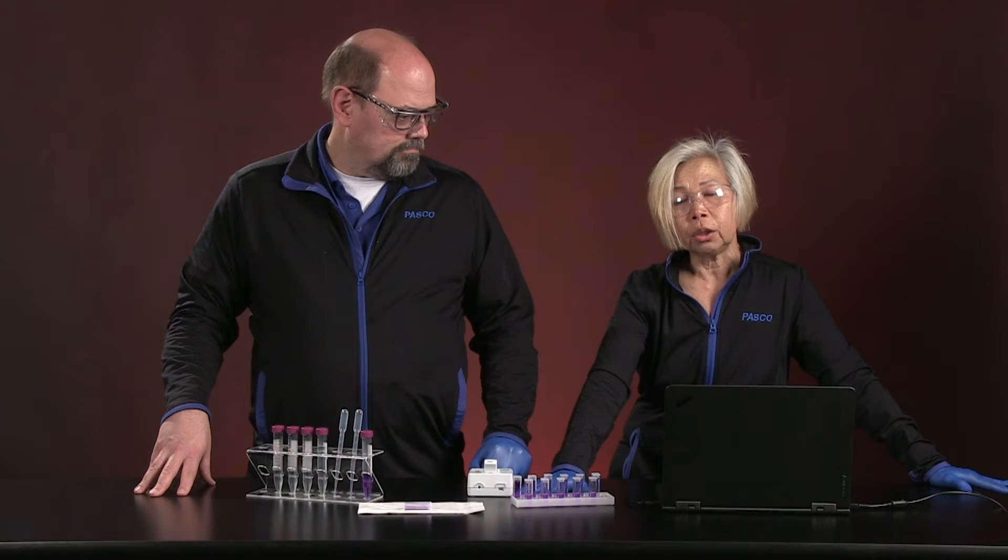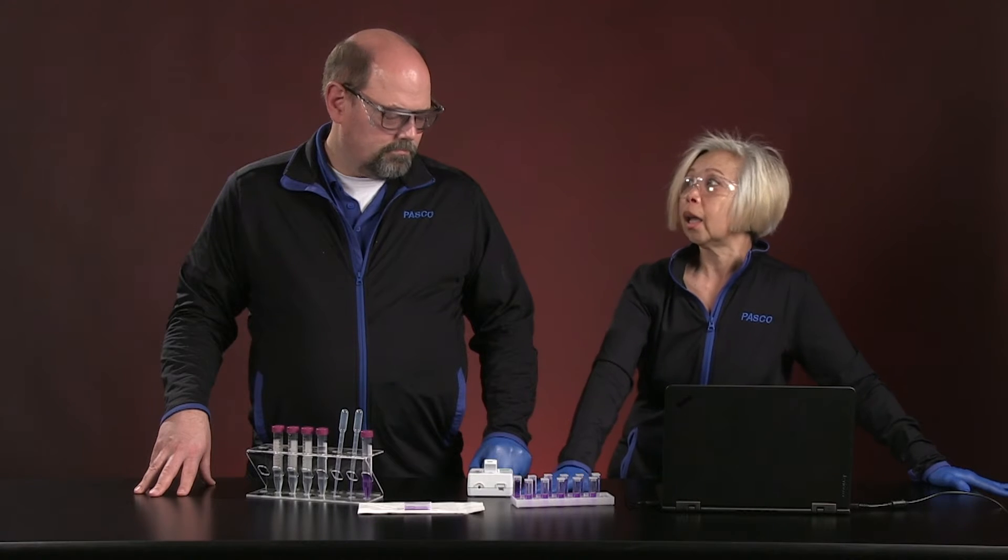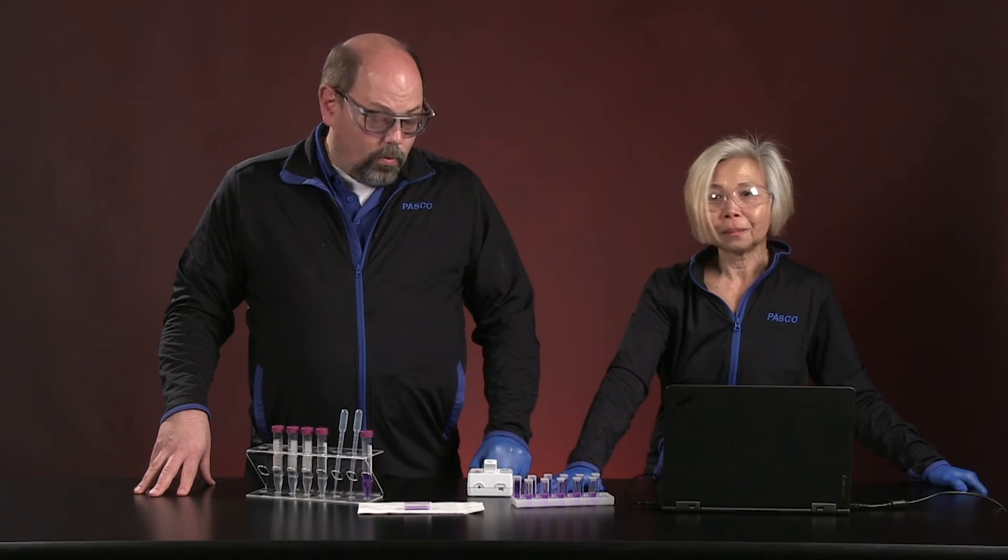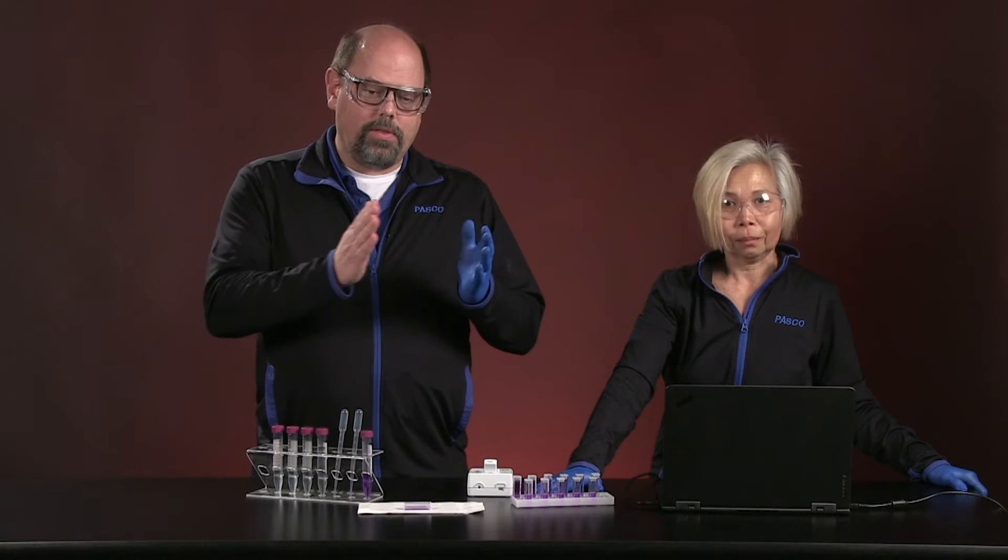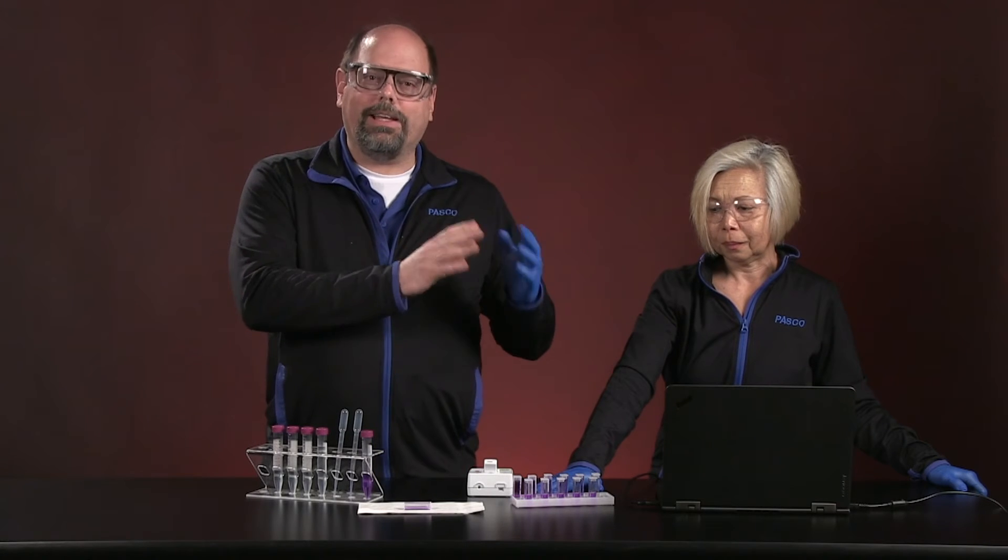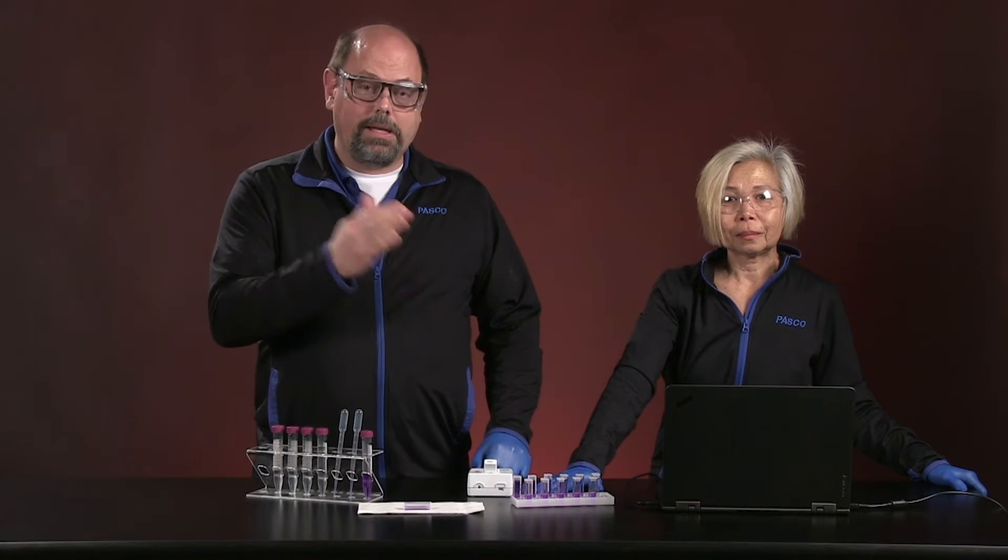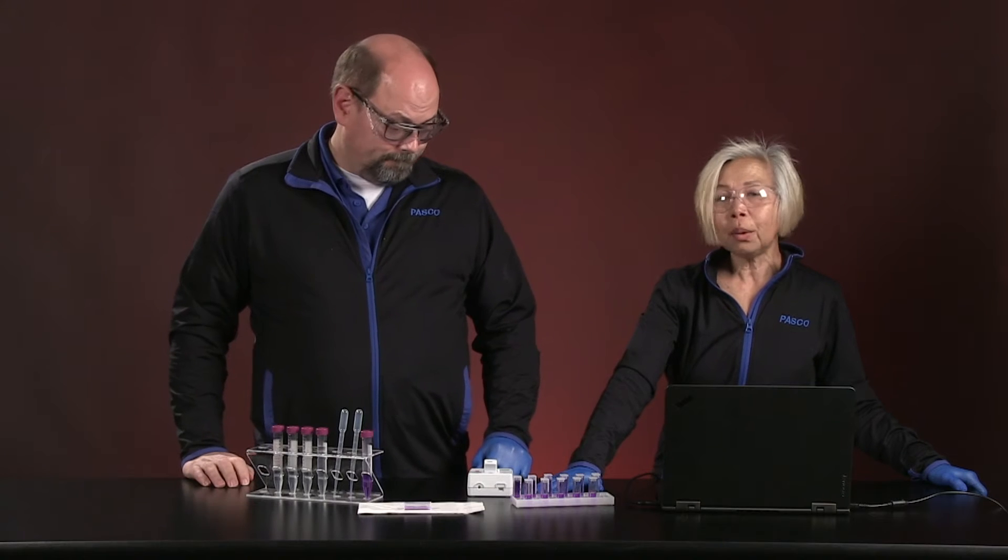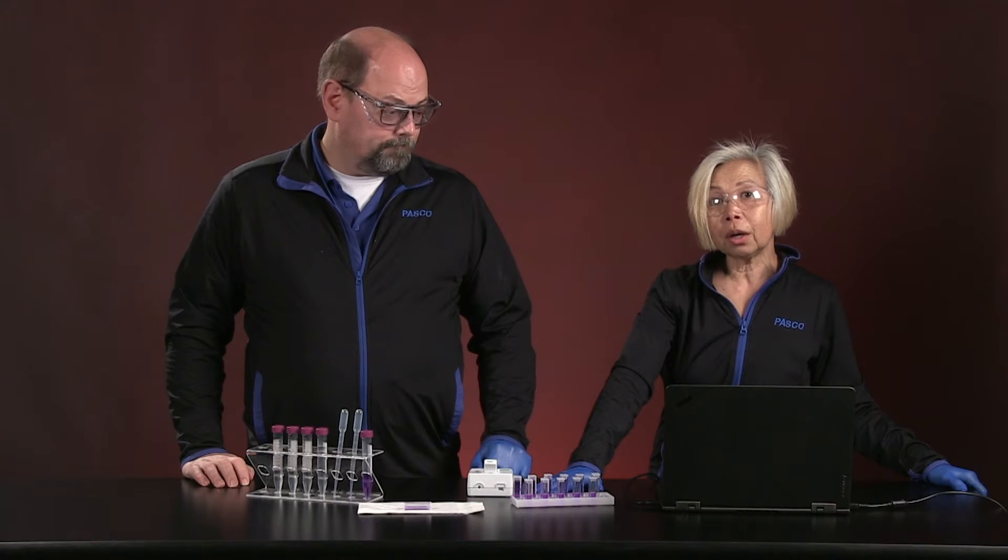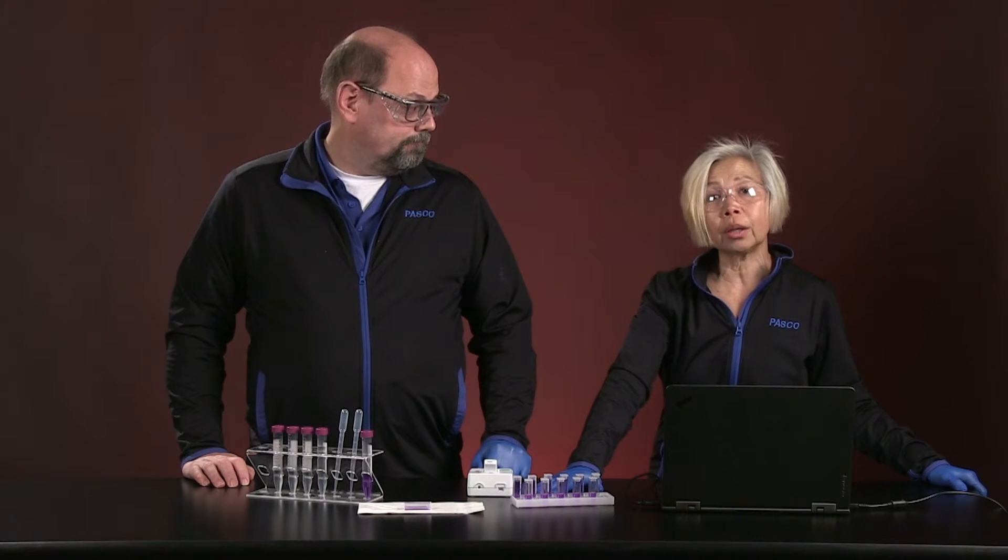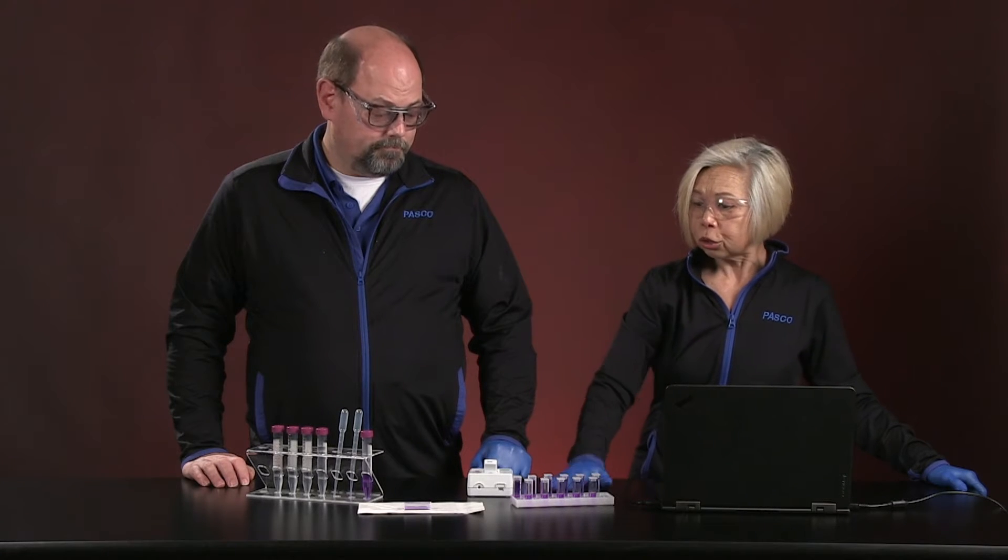The answer for that is very simple. Whenever you do a kinetic study, you have to be very, very conscious of the concentration of dye. Why is that, Roger? Well, if you're going to have the dye fade and it's so dark you can't see through it, you won't know that you've gotten any lighter until you finally get down to the last little bit. So if you want it to be linear, you want to start from the place that the light can see through it and start fading from there. So we want to pick a concentration along the calibration curve that is dark enough that we will actually see a change in the color of that dye over time when we add a bleaching agent.